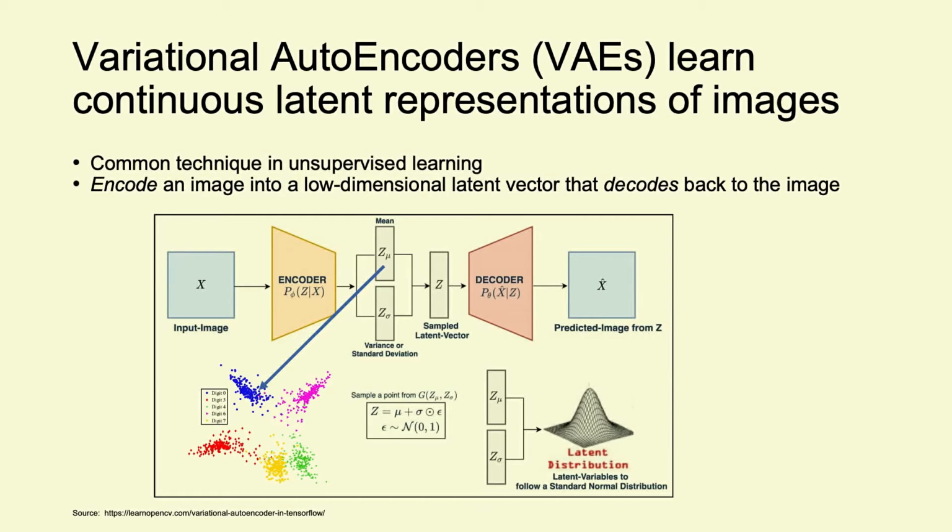We have an encoder network that does amortized inference on latent vectors that we use to describe what this image is. Then we have a decoder that takes those latent vectors and tries to reconstruct the image. We train this end to end by feeding in an image, doing inference on latent variables, feeding that through the decoder, getting our output, and minimizing the error between the output and the input.